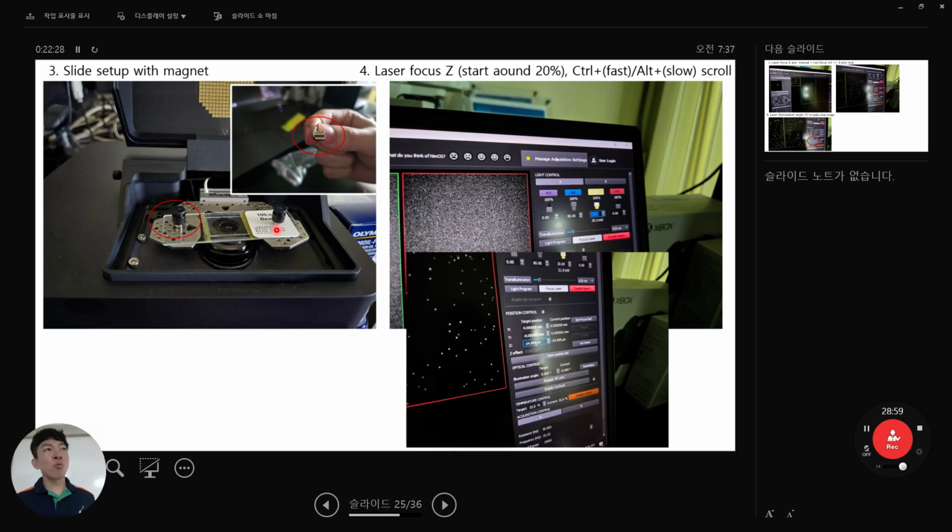So the thing is that we tried many times with hydrogel, but even though we fix the hydrogel, it shifts a little, even 1 nanometer. While we are taking images, maybe 2 or 5 minutes for getting 10,000 pictures, the image shifts a little.